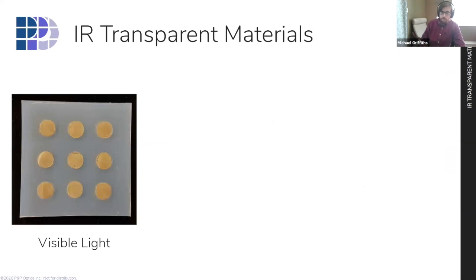Now, getting back to hyperspectral imaging, there are some interesting features that can occur and be exploited. So here we can see a system verification target where it's bits of cardboard mounted within a plastic medium, so it can be repeatedly imaged to determine the repeatability of system performance. Now, one thing that's interesting to note about the plastic matrix for this target is that it's actually transparent within the NIR region that we are scanning.